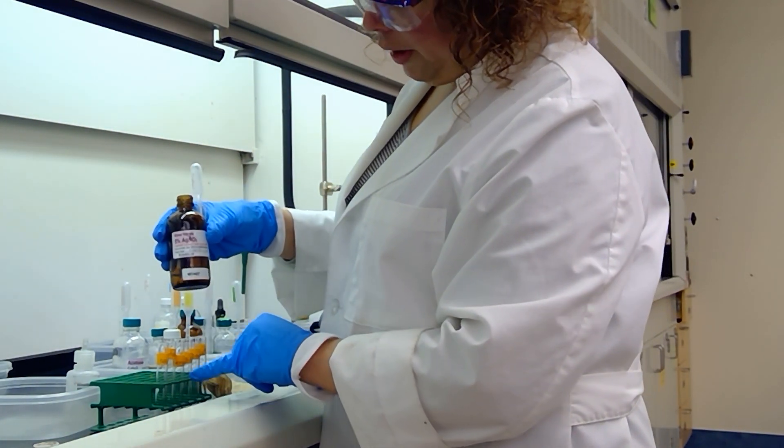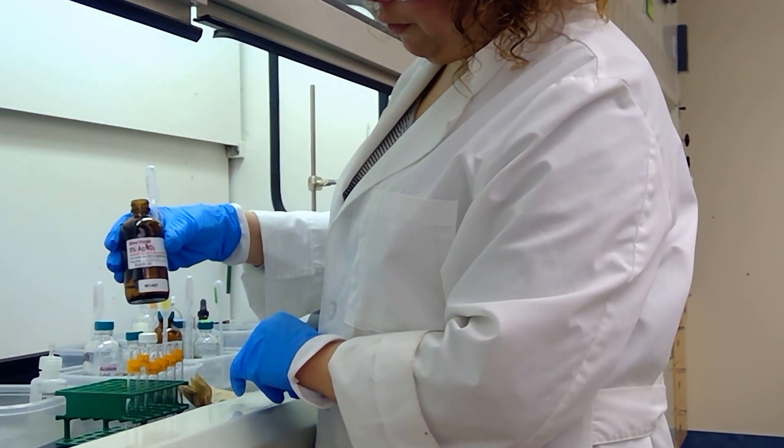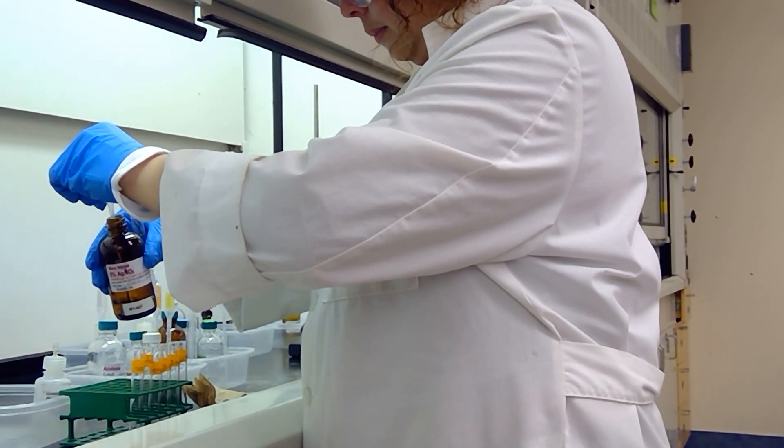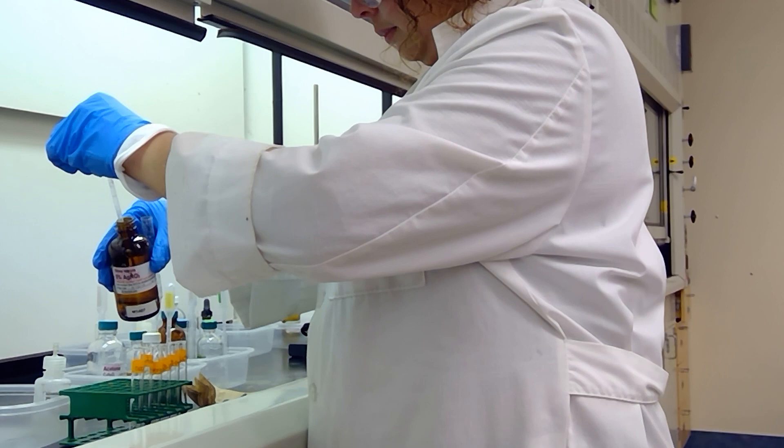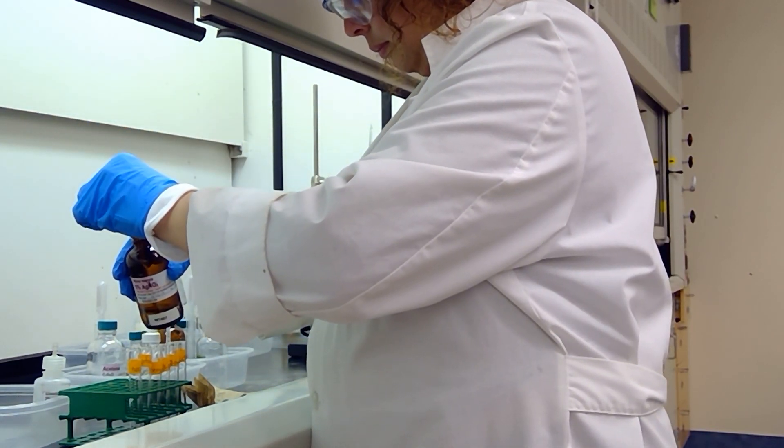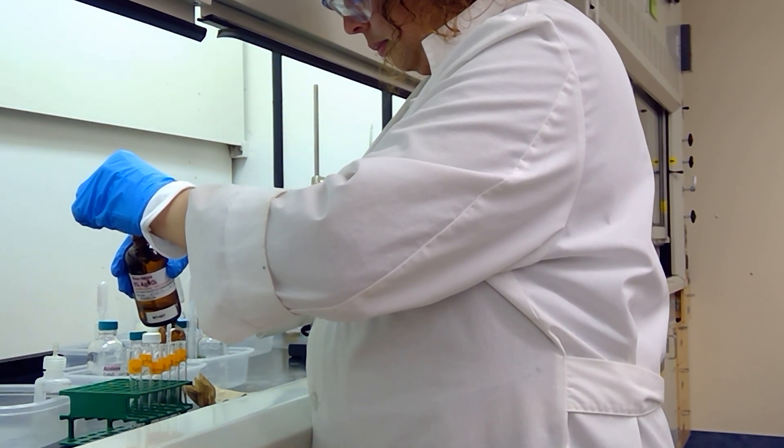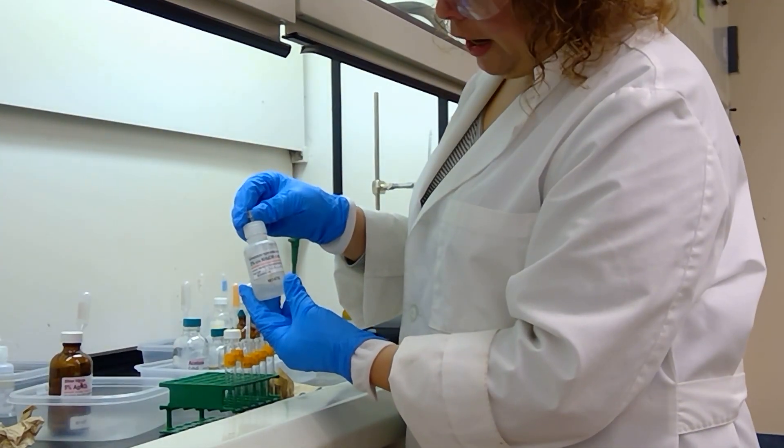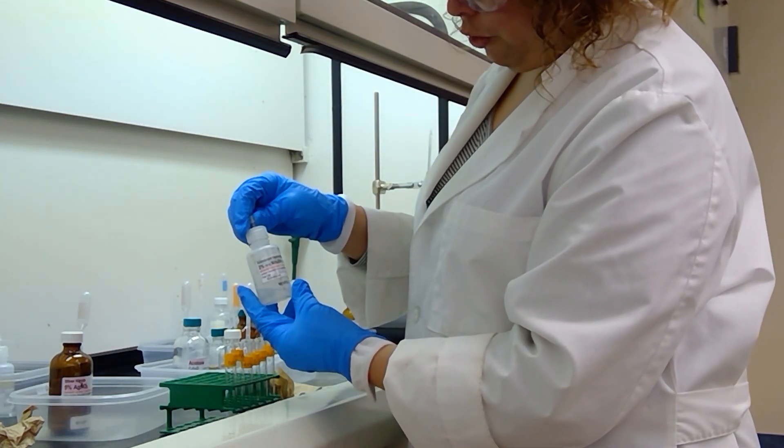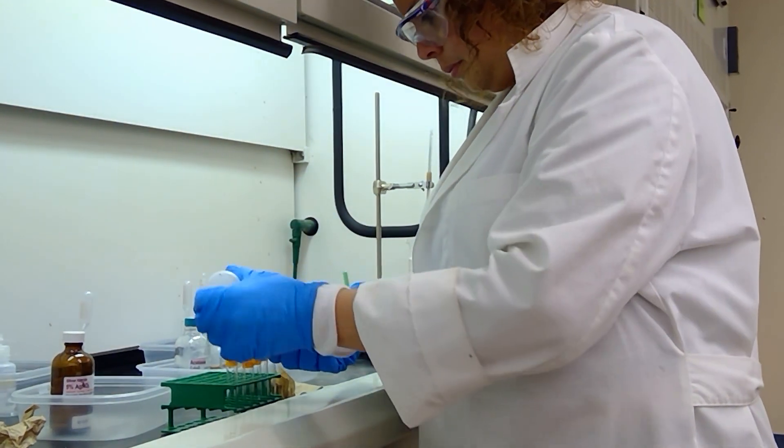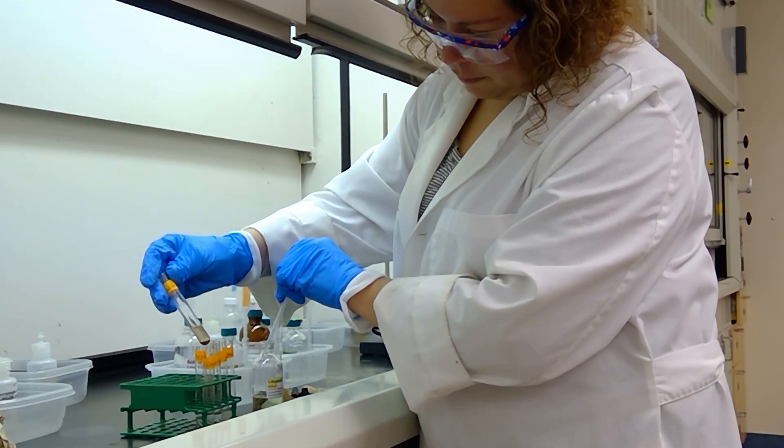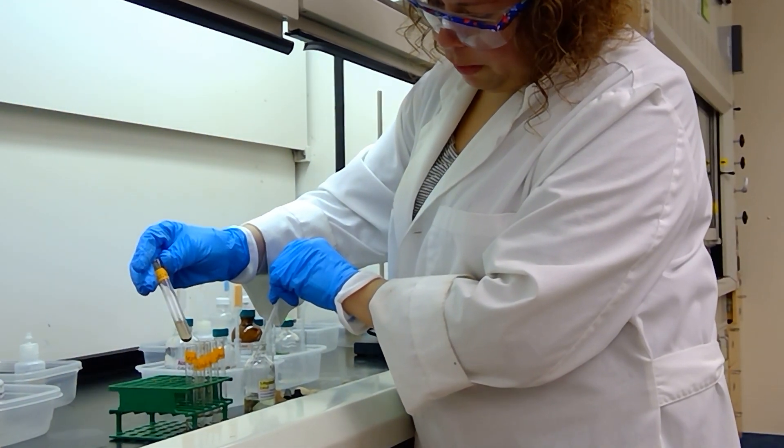We're starting off by adding 1 ml of silver nitrate solution to each of our test tubes. Next we're adding 2 drops of ammonium hydroxide solution to each of our test tubes. You can see the ammonia gas being formed over the top.